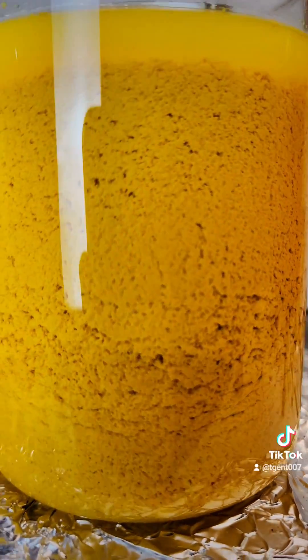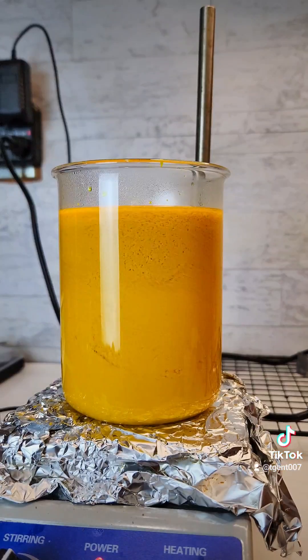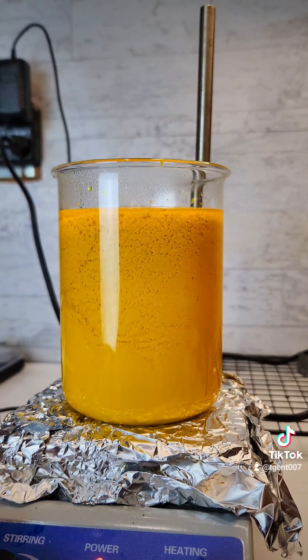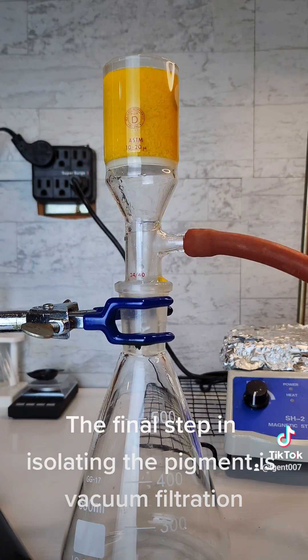Once the sodium dichromate is added, the pigment begins to fall out of solution. It's kind of fun to stir. The final step in isolating the pigment is vacuum filtration.